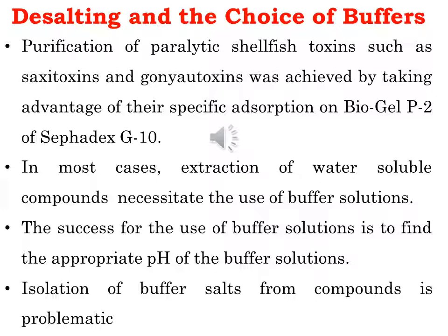Several volatile buffers have been suggested to avoid this problem. These buffers are mostly the combination of weak bases and weak acids which are bound only by weak ionic interaction and are volatile under reduced pressure or lyophilization. However, in reality, these buffers are not so easy to handle. For example, the organic buffers containing pyridine and other aromatic bases have intolerable noxious odors and are difficult to use in a closed cold room. They also may not be acceptable in the modern laboratory for safety reasons.